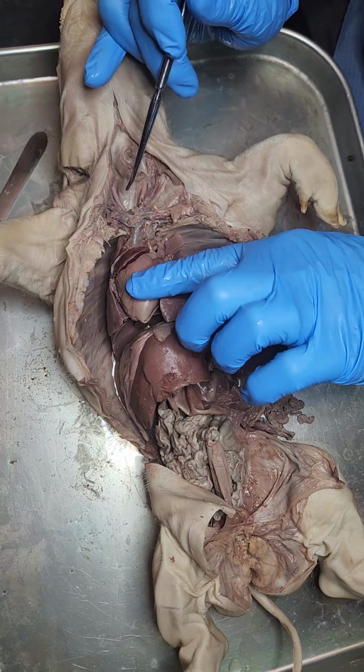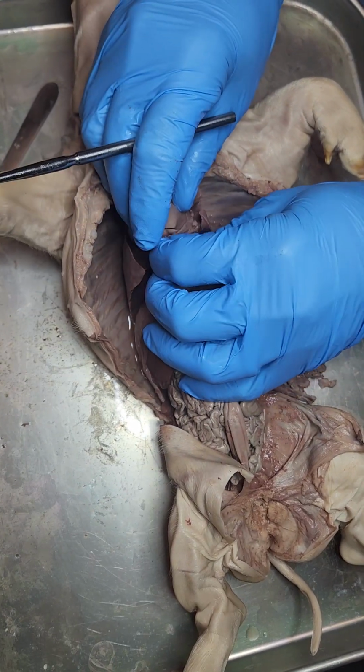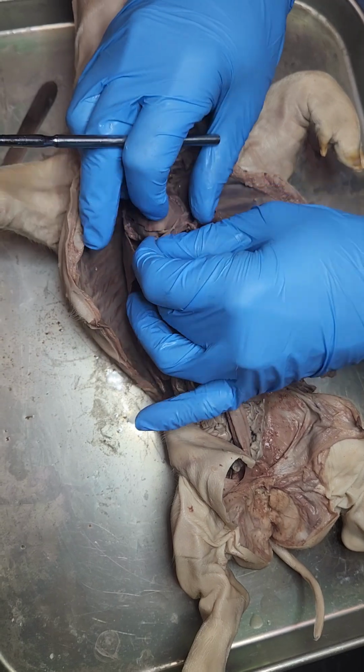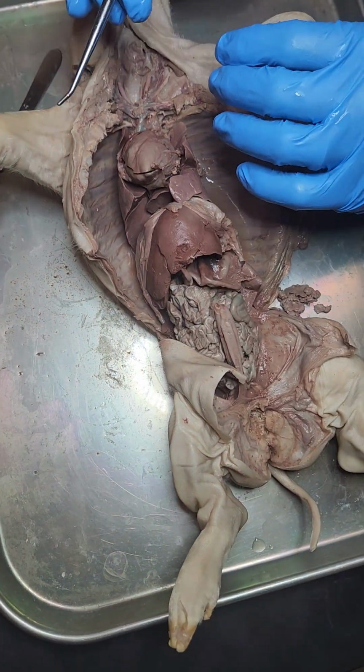Okay, then we have heart, which is right here. Okay, and a pericardium is what surrounds the heart. So it's this tissue here. Okay, it's what inflames. That's what contains that fluid and makes the congestive heart failure occur.